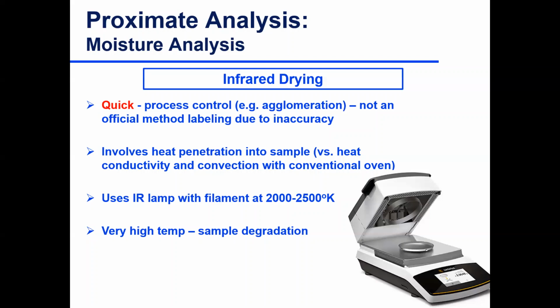So infrared lamp, very high sample temperature. The infrared lamp is hot, so you get some potential sample degradation. It depends upon the sample you're running.